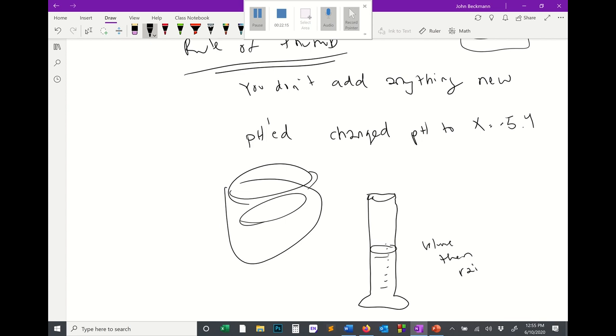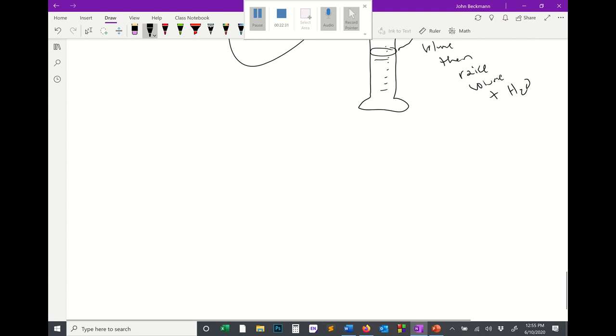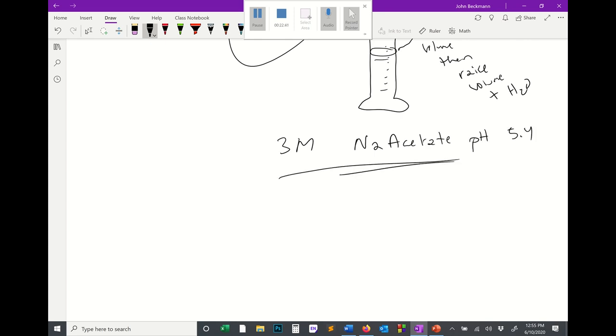Then raise the volume by adding water to your final volume. And this will give you your final solution, which should be 3 molar sodium acetate, pH 5.4. Done. You're so good.